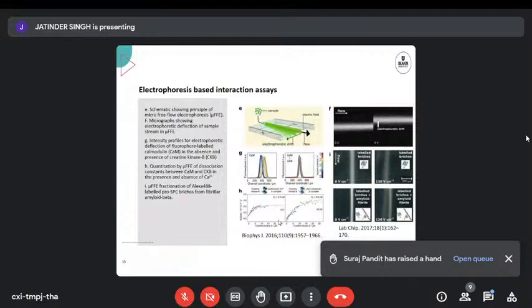So you can either collect them at the outlets separately. At the outlet, we must have some holes. Or you image them on the chip and you've got one big outlet. So these experiments have only measured at the end of the cell how far they've migrated from the center. So here they've not done any collection, and then you don't need separate outlets. But if you want to work up your proteins or do any other work, then you need to have a whole network with different bits of tubing sticking out at the other end.